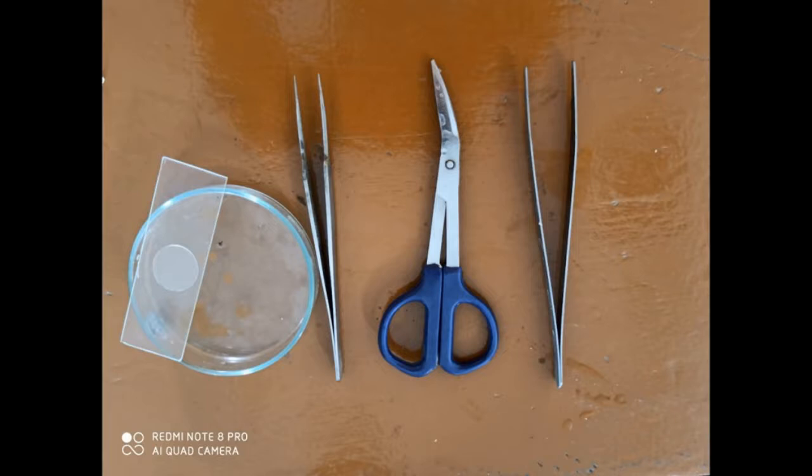For mounting we require bent scissors, forceps, slide, coverslip, and petri plate.